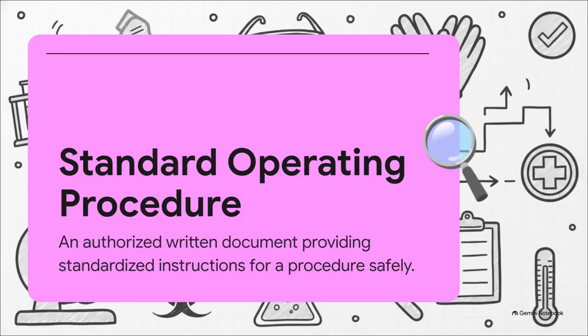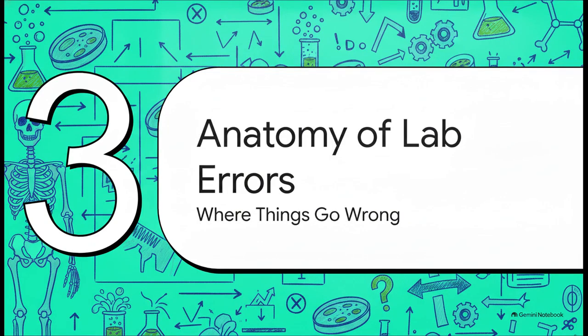Well, an SOP is a standard operating procedure, but it's really so much more than just bureaucratic paperwork. It is an authorized written document that gives us highly standardized instructions for performing a specific procedure safely and consistently. Think of it as the literal blueprint of the lab. By standardizing exactly how a test is run, SOPs cut out the variation, they improve reproducibility, and ultimately, they prevent catastrophic medical errors. But what happens when that blueprint gets ignored?